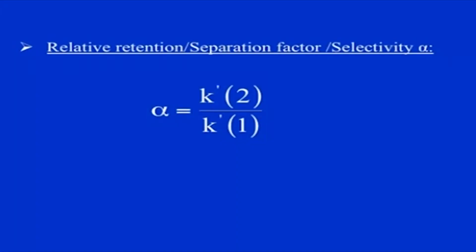It is a relative retention ratio for two analytes, that is, the relative retention of analyte 2 in comparison to analyte 1. The selectivity factor is also important in assessing the performance of a particular column type. The selectivity factor is affected by the chemical nature of the two phases.